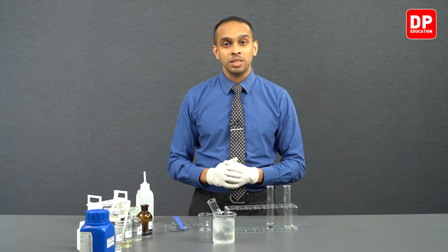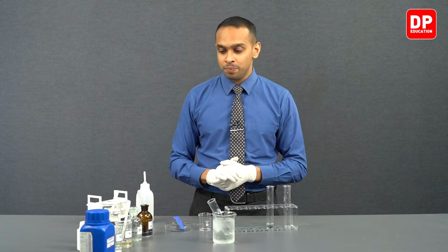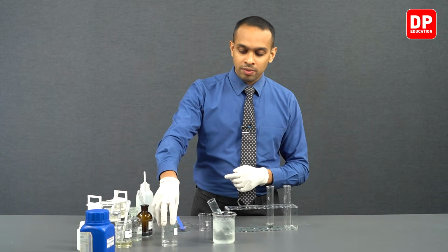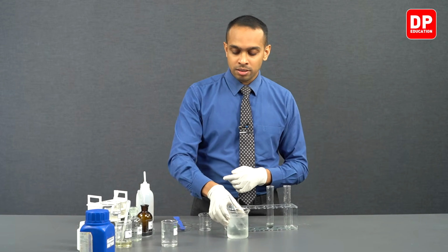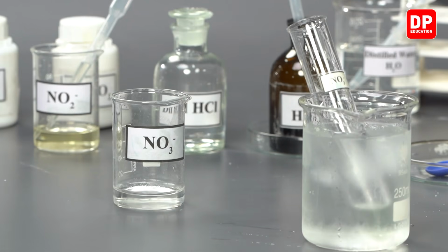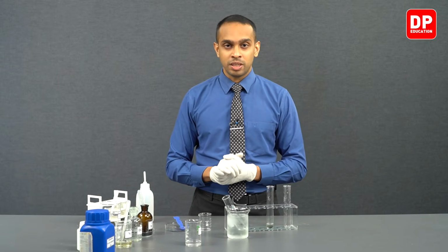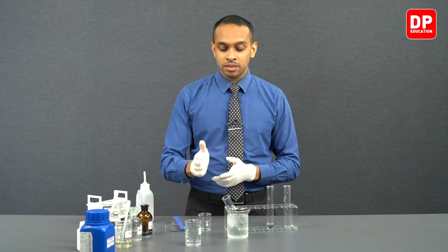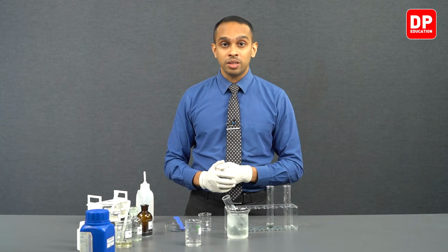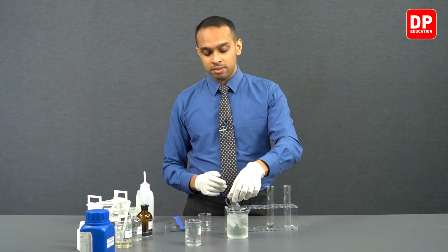So by cooling down the Fe2+ aqueous ion solution mixture, and as it cools down, we can take our nitrate ion solution that we have here, and we can add about 2 cubic centimeters of nitrate ion solution to this Fe2+ aqueous ion solution that we have here.